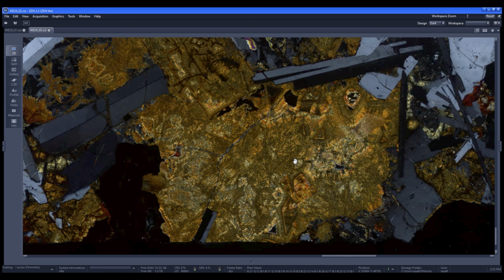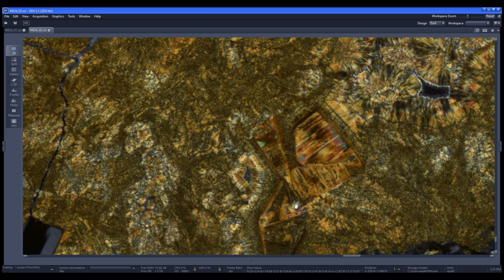So again, these rocks are super old, and they've been weathered and altered, and some kind of fluid came in that had calcite, and it deposited all kinds of calcite mineralization. So this rock has been altered, which is not good when it comes to my research geochemically, because when a rock's been altered by fluids, it can not only remove minerals and elements from the rock, but it can add to it, like this calcium here. So, a bit unfortunate, but really cool to see in thin section.